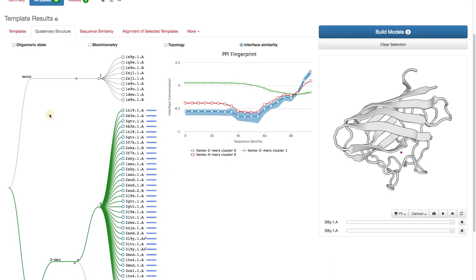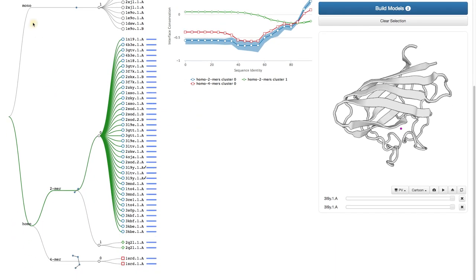First, we see that the tree is grouped into monomers and homomers, then according to the stoichiometry, in our case dimers and tetramers.